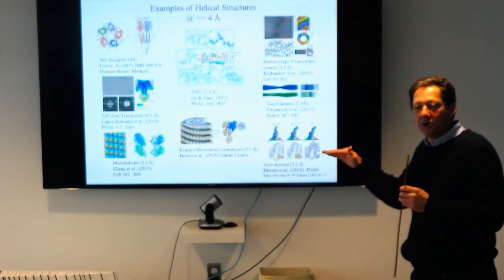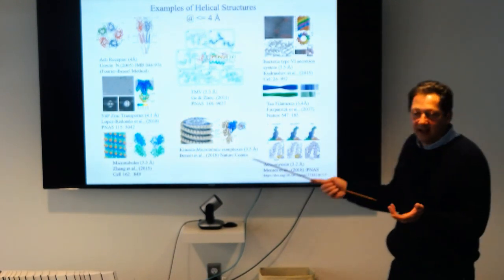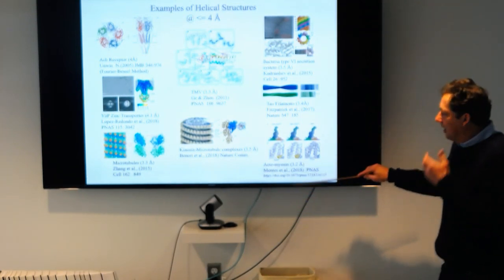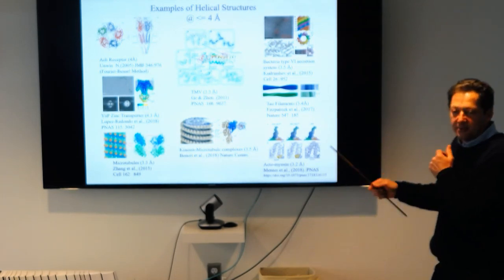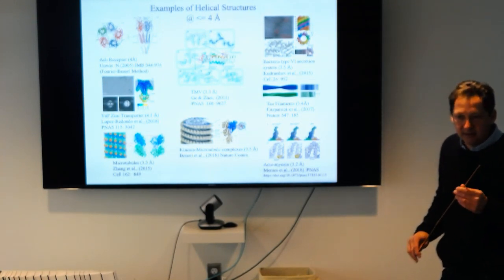I would probably try first with RELION. I think Greg is using RELION, though he has his own custom method to analyze microtubules. He said that he's using RELION to get the actomyosin map, probably also in this range. So probably that would be a good way to start.